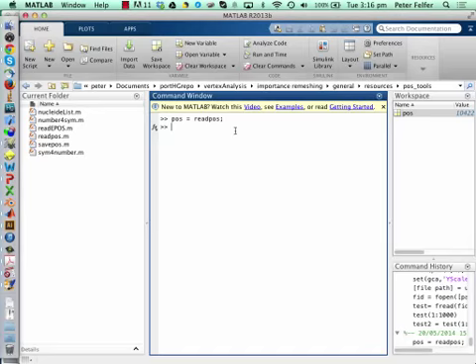That's of course the raw data. Raw data means we haven't pulled out what's carbon, what's iron, and so on. But one simple thing would be to say, we know that carbon is a peak around 6. Of course we would do that for every single range.